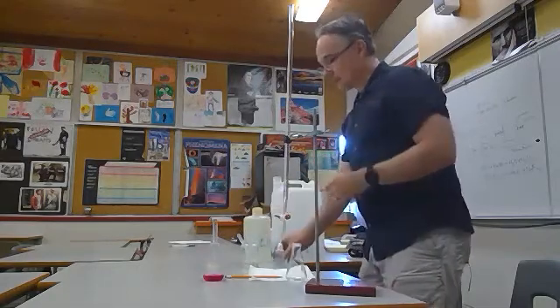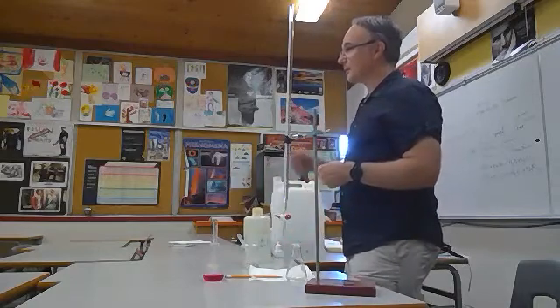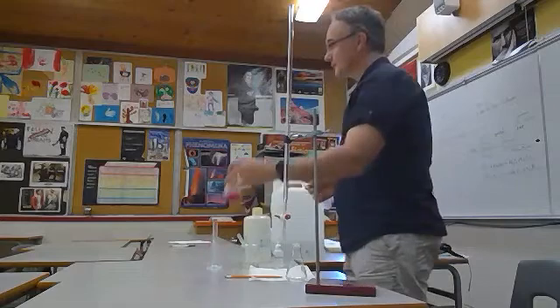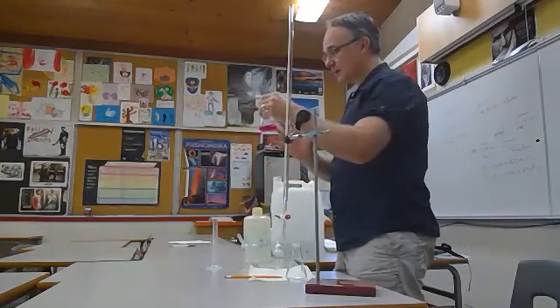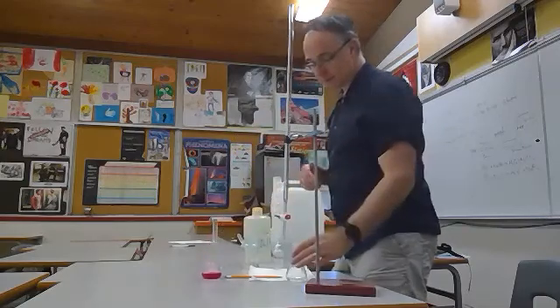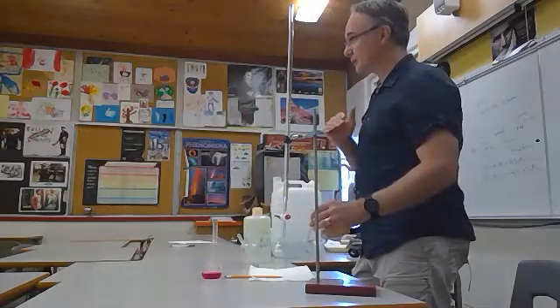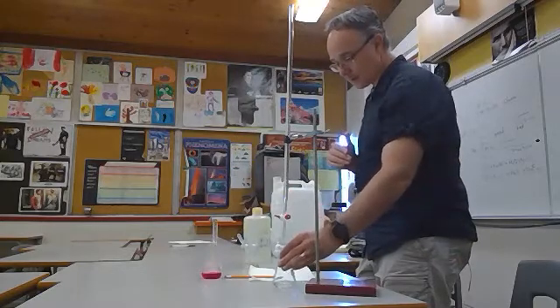Generally with a titration, what you do is add like 2 mils at a time, or maybe 4 mils at a time. And the first time you do it, you basically overshoot the mark. When I did this here, I added 22 mils of base, which obviously is too much. What I want is a light shade of pink here. So I'm going to add base to this. I'll just do one try. We'll ballpark the numbers here. Normally you would do this 3 or 4 times till you get a pretty accurate amount of base being added, but we're tight on time.